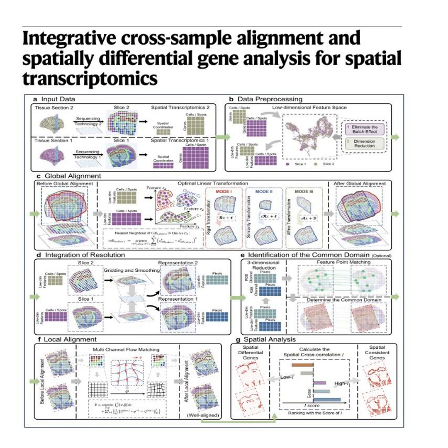And that's where spatial transcriptomics, or ST, comes in. If traditional sequencing is a smoothie, ST is like a highly detailed city map. Yeah, that's a great way to put it. It doesn't just tell you that you have muscle cells and immune cells. It shows you exactly which cells, think of them as houses, are expressing which genes in their exact physical locations. And that spatial context is everything. I mean, it allows us to see how cells interact in their local microenvironments, like who is talking to whom, where are the immune cells gathering. Right. That geography is vital for understanding developmental biology, cancer, and just incredibly complex disease mechanisms.